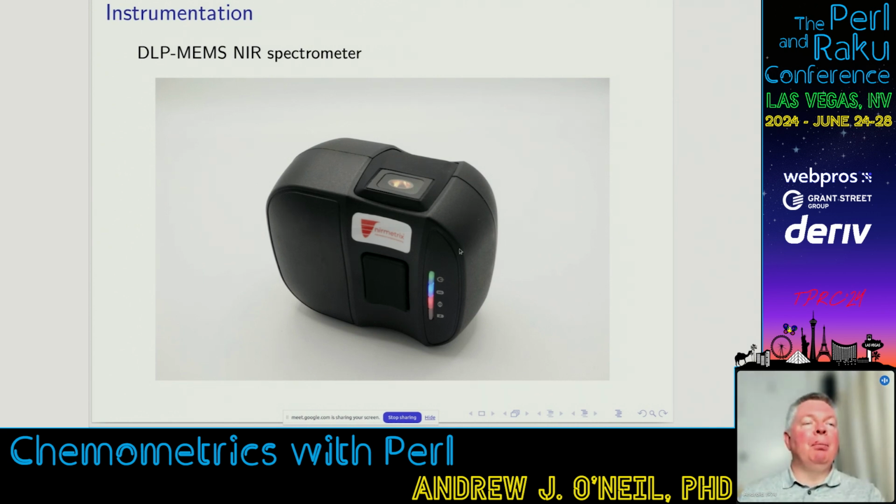It can do that in a few different modes. There's a linear mode where it'll switch mirrors on and off in a straight line and scan through a particular spectrum, or it can do a type of Fourier transform called a Hadamard transform. But in this case, I think I've just stuck with the linear mode, because I think that's recommended by Texas Instruments.